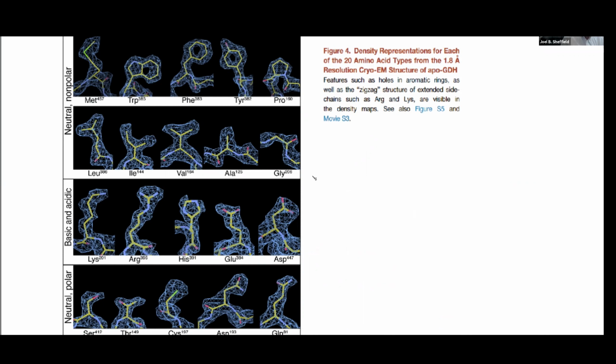So it's really quite impressive as a result from a technique that I would guess has really exploded within the past 5 years or so. It's really an extraordinary technique. It requires very specialized electron microscopes, very specialized computational facilities. One of the comments that I've read on it said that a standard lab to do this kind of work would probably cost $5 million.